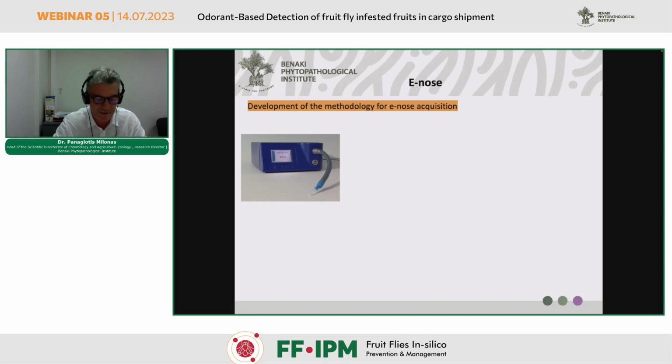We use AirSense Pen3, which is an intelligent chemical sensor array for identification of gases and vapors, which is equipped with 10 metal oxide sensors for different categories of detectable volatile substances.